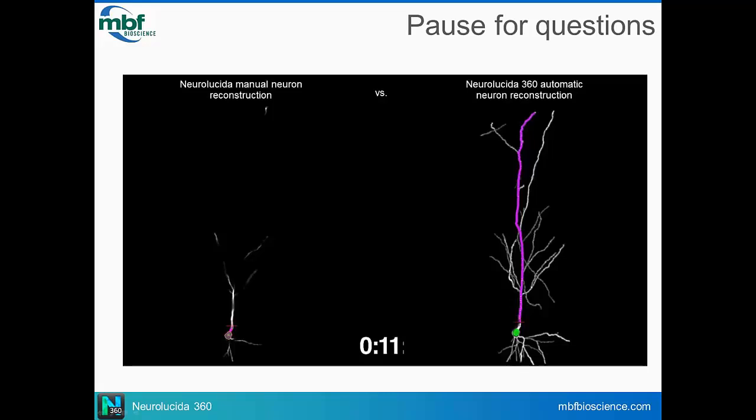Dara, tell me about floating spine heads. That's because there's not enough fluorescence in the neck because the neck is so thin, right? So that they appear to float. What do you do in that instance? I mean, it's obviously still a spine. In the past, we've counted them. They're thin spines in our experience, or just the spine neck is just so thin. It's below the resolution of the microscope that you can get, right? But it's still considered a spine.